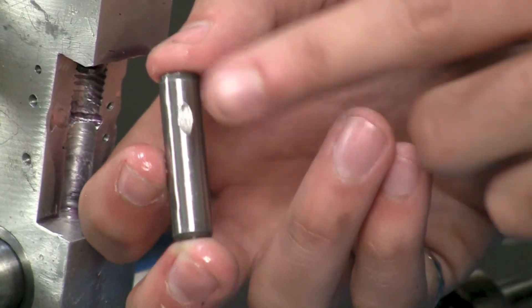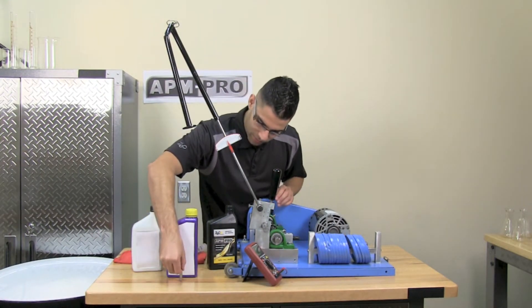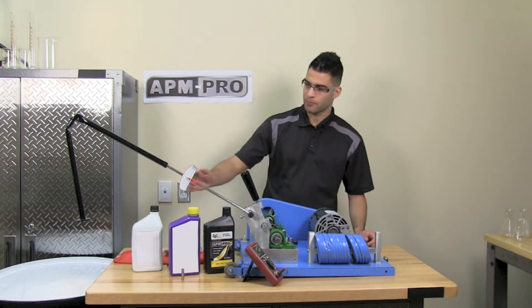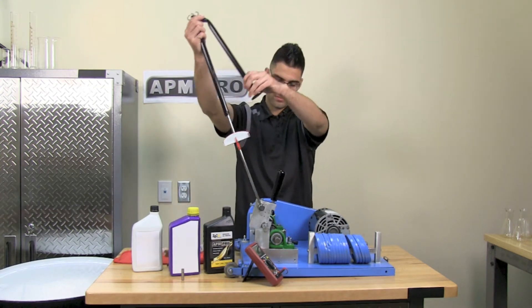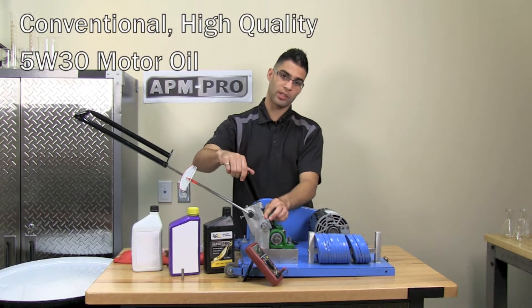You can see that the pin has a pretty big scar. I have cleaned the metal surface so that we have a fresh start point.